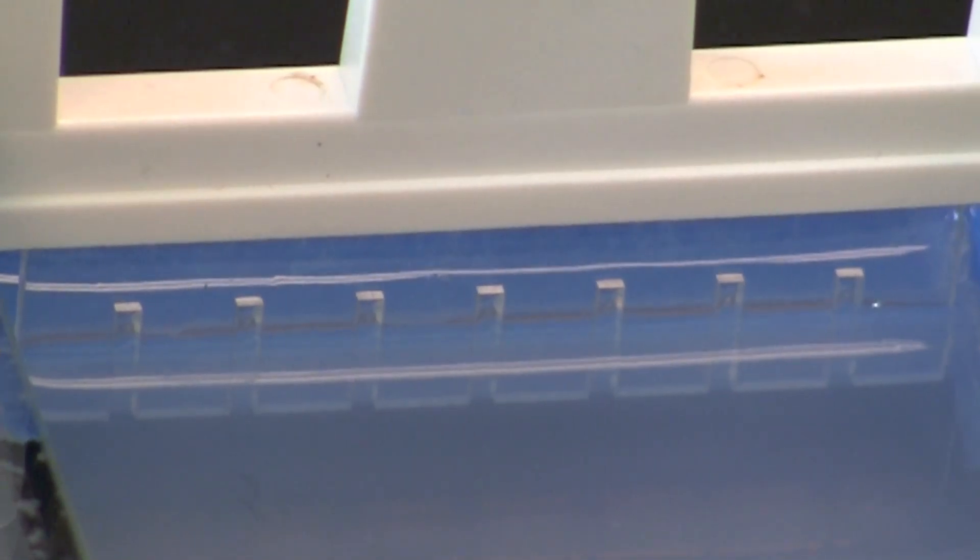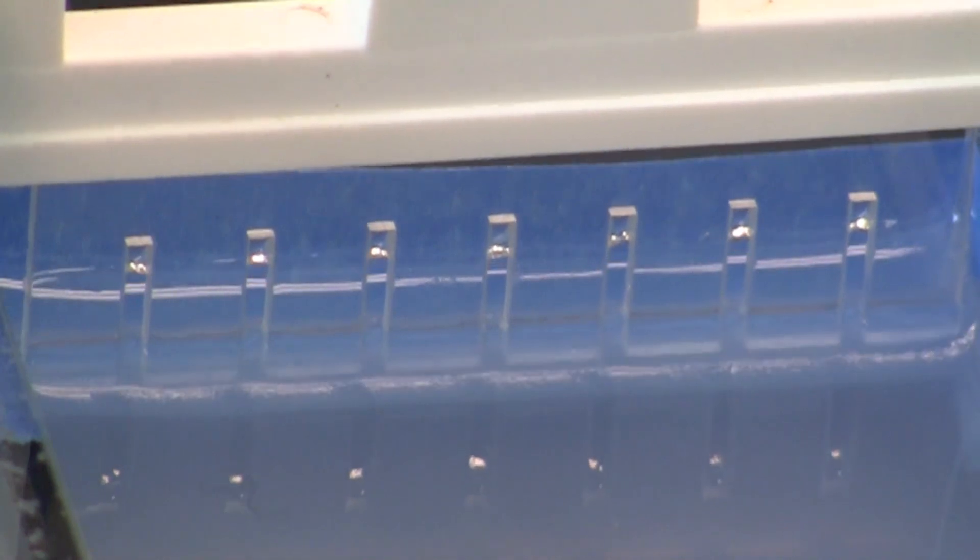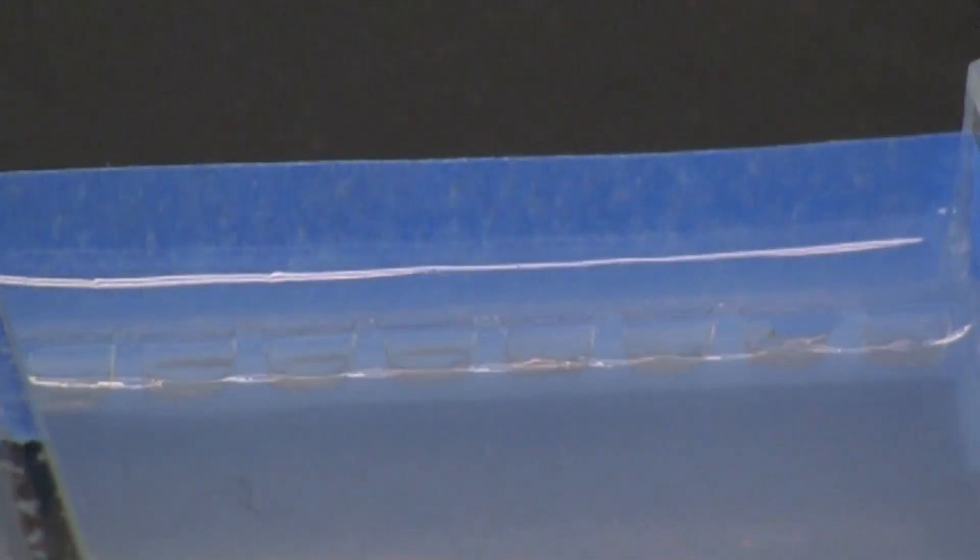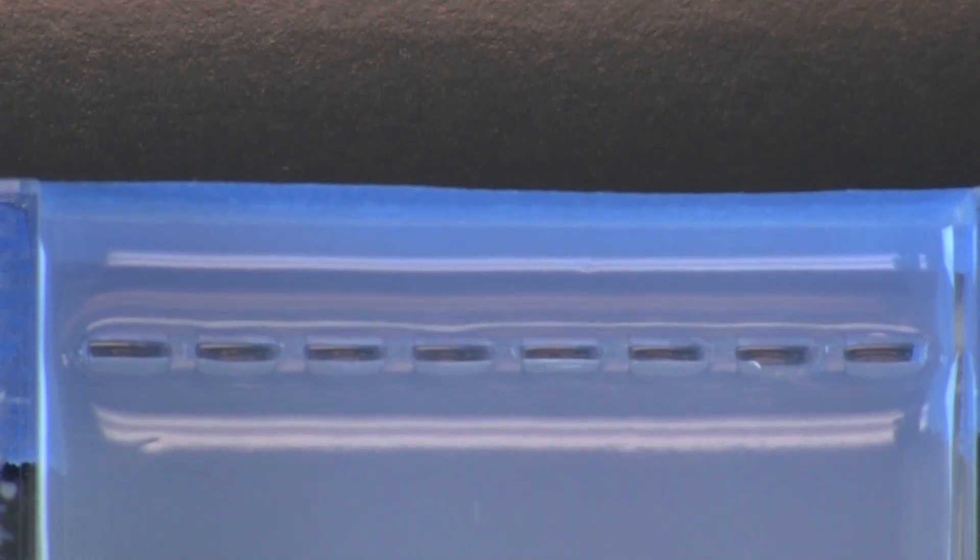When the gel is cool and opaque, remove the comb by pulling it gently straight up and out of the wells. You should be able to see that each well is well formed. If the comb is removed before the gel is set, the wells will collapse.